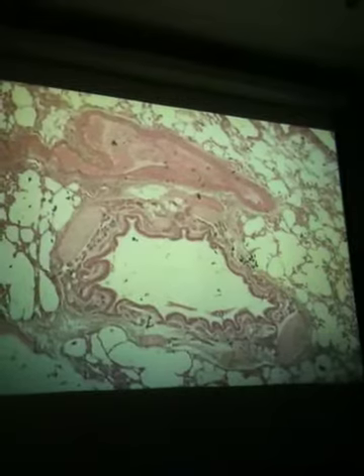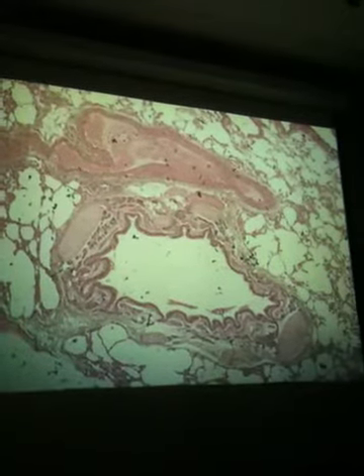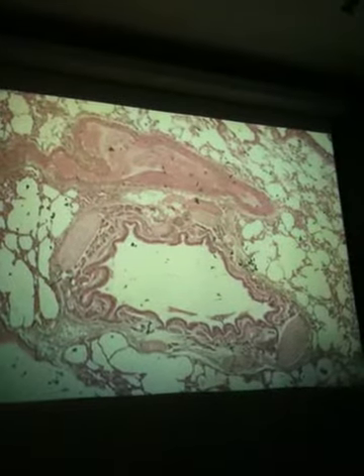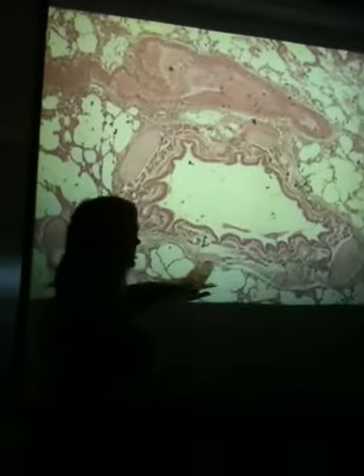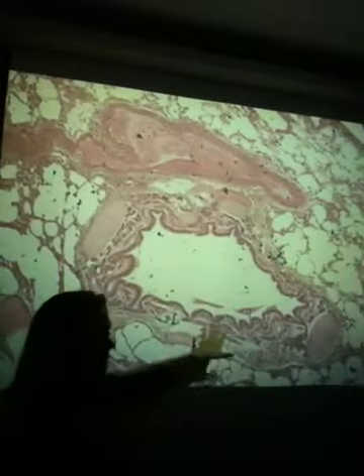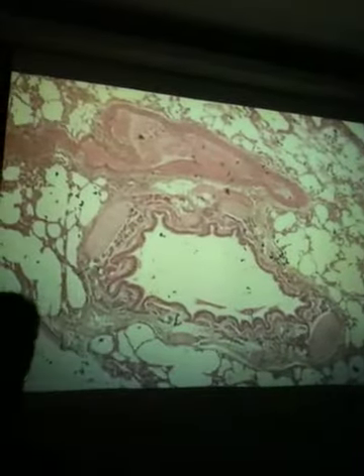You also need to be able to tell the difference between a bronchi and a bronchiole. Bronchioles are going to be little, and they will lack cartilage. Bronchi are going to be bigger, and they'll have cartilage. Here is what the cartilage looks like — it's been a while since we've seen it — but these are all examples of cartilage. That tells me that this is a bronchi.